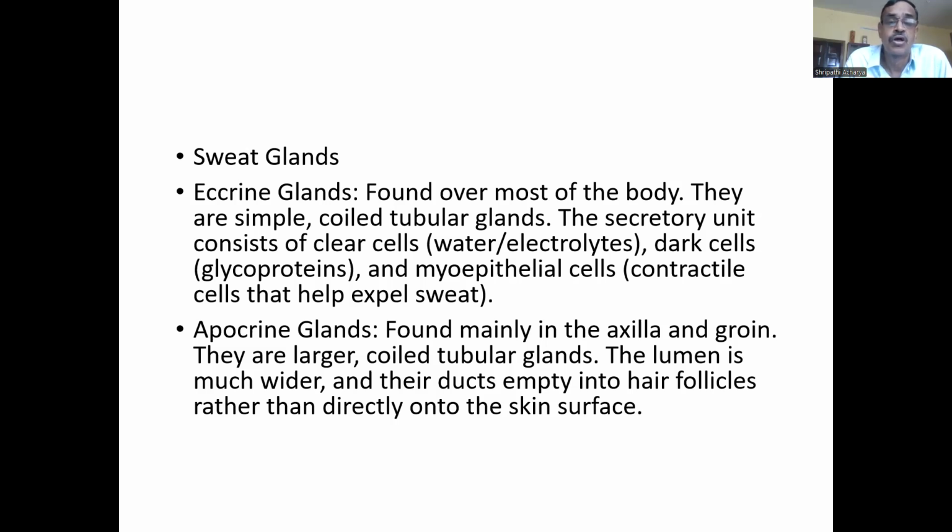They are larger, coiled tubular glands. The lumen is much wider, and their ducts empty into hair follicles rather than directly onto the skin surface.